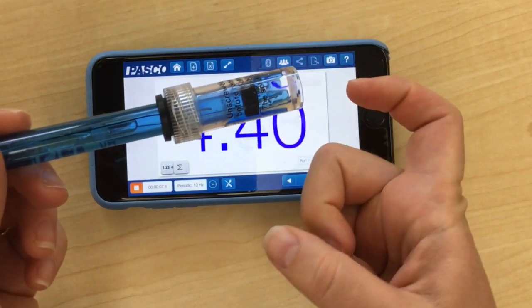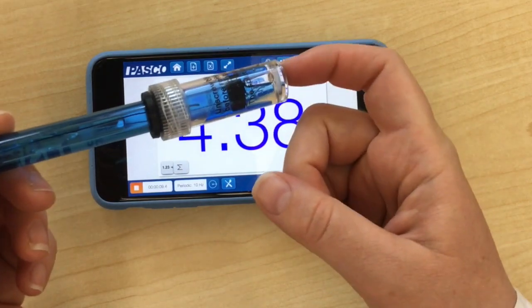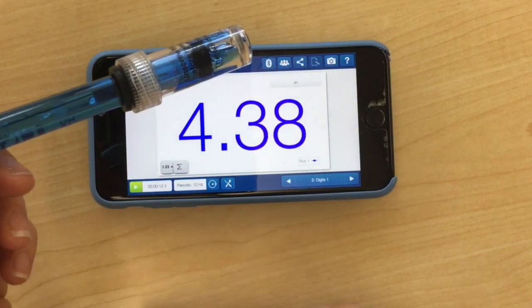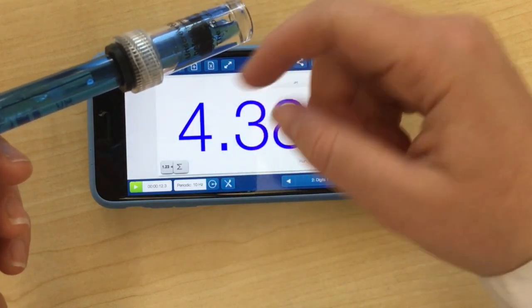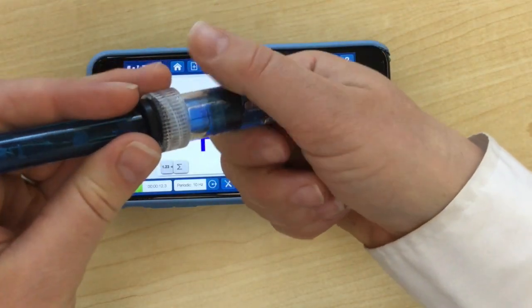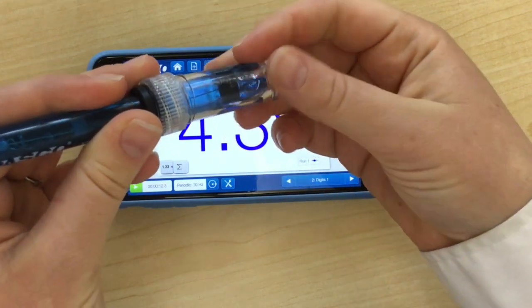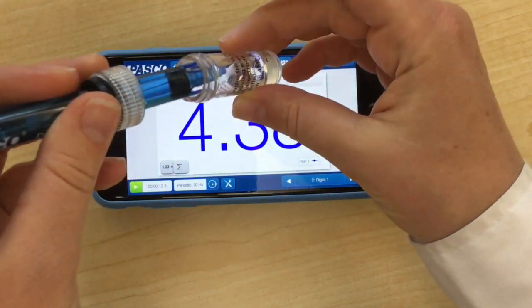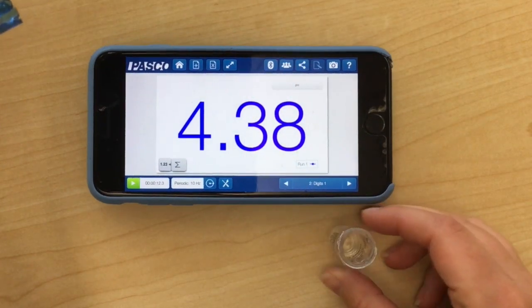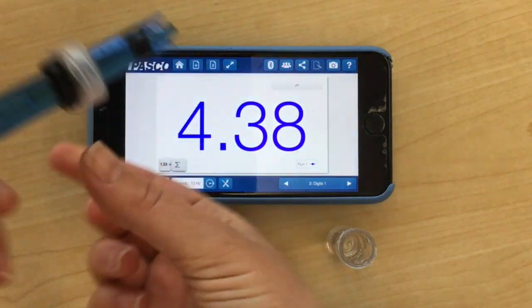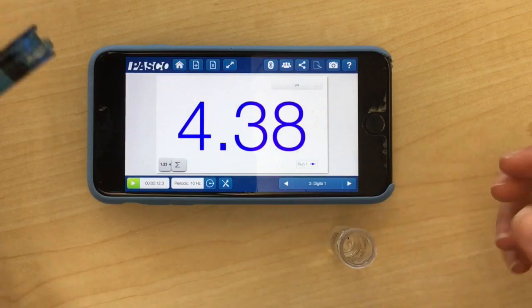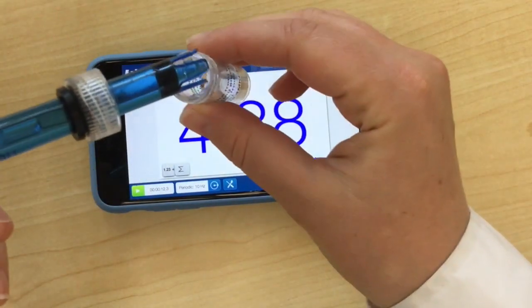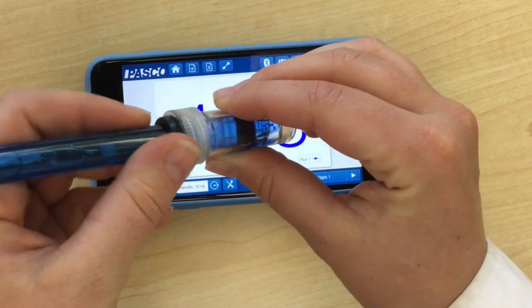It's important that you remove this cap from the bottom. There is a buffer in here that protects the electrode. Make sure that you don't lose the solution when you take it off. You just have to unscrew it, and you can put the solution off to the side. Then you can use this part of your probe in your solution. When you're done with it, you can rinse it off with some distilled water and put it back into your solution here.